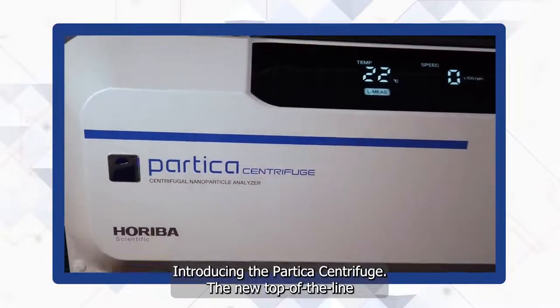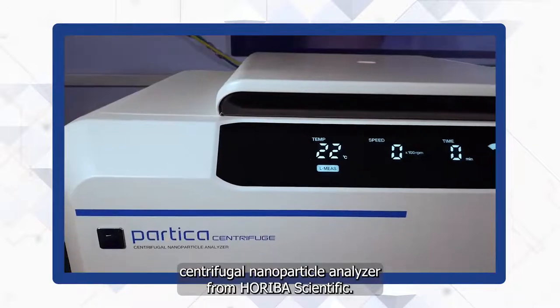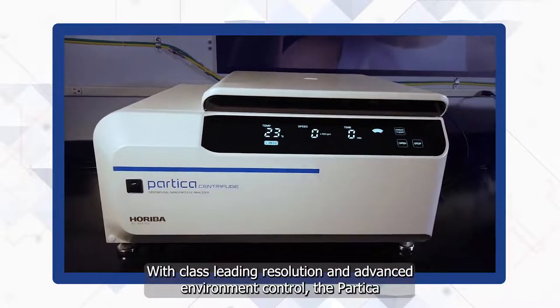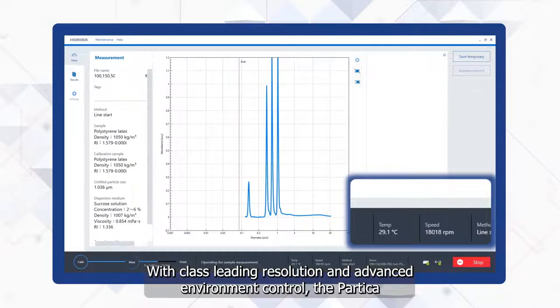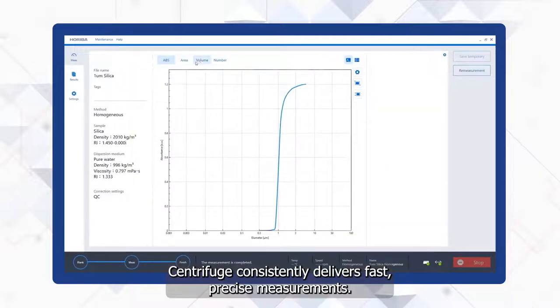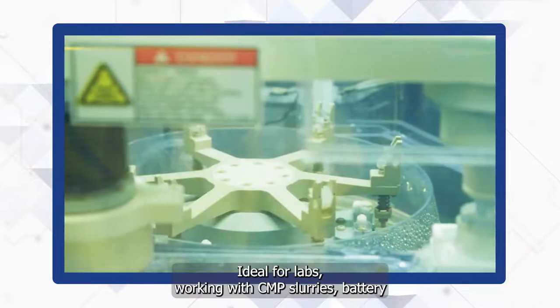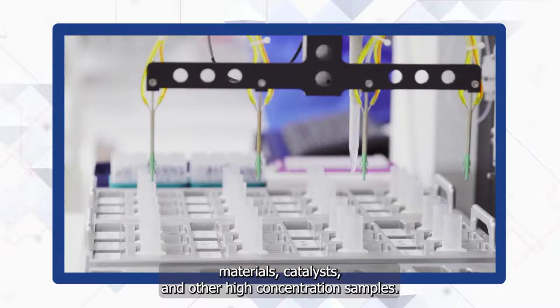Introducing the Partica Centrifuge, the new top-of-the-line centrifugal nanoparticle analyzer from Horiba Scientific. With class-leading resolution and advanced environment control, the Partica Centrifuge consistently delivers fast, precise measurements ideal for labs working with CMP slurries, battery materials, catalysts, and other high-concentration samples.